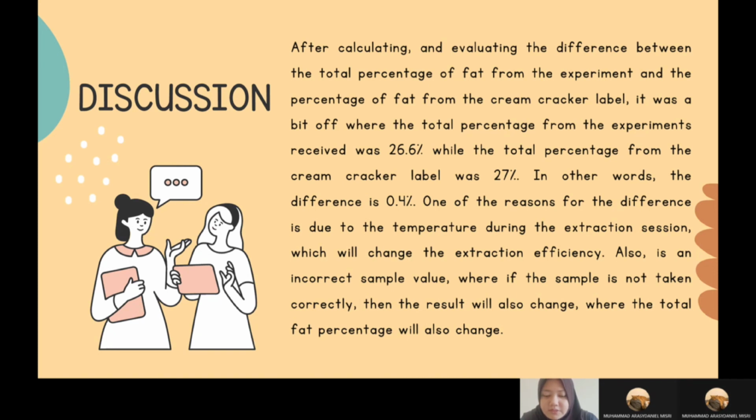One of the reasons for the difference is the temperature during the extraction session, which will change the extraction efficiency. Also, an incorrect sample value, where if the sample is not taken correctly, then the result will also change, where the total fat percentage will also change.